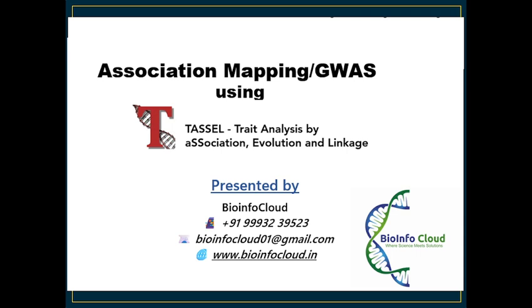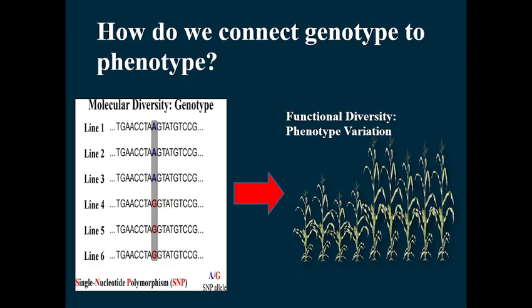In this class, we'll discuss a brief overview of association mapping or GWAS using the TASSEL software. Let's start the class.